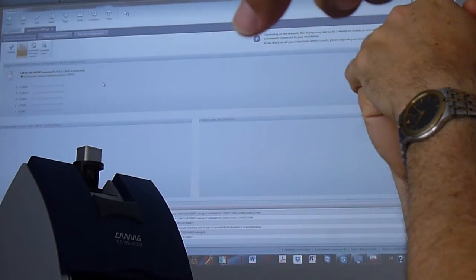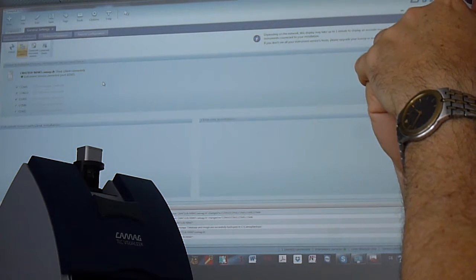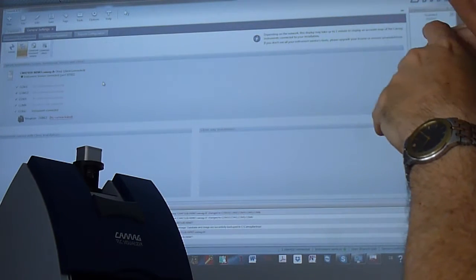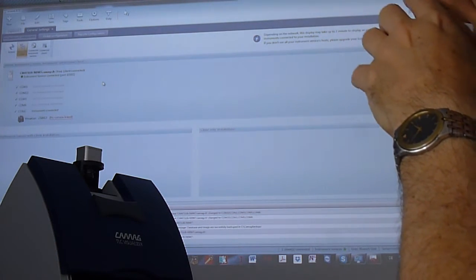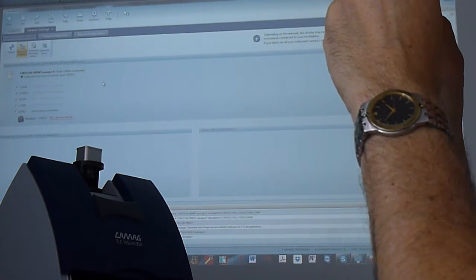This off? No. The instrument is off. Yes. Very good idea. That's right. We made it all together. I think it is really a good example.